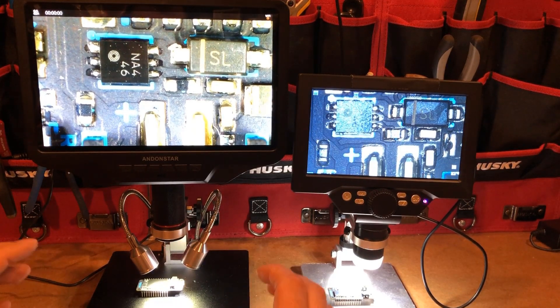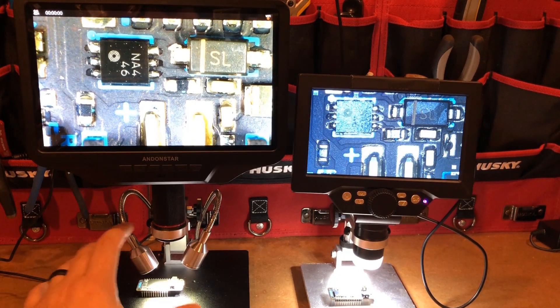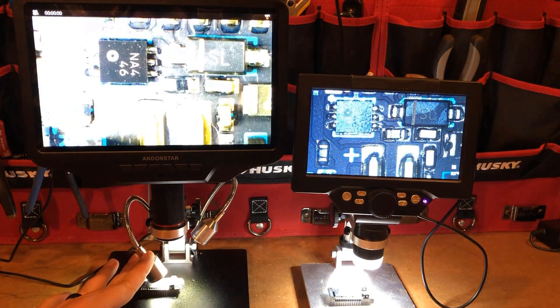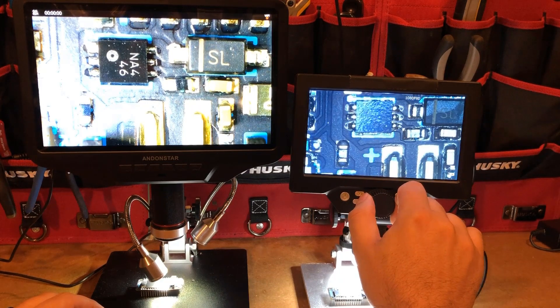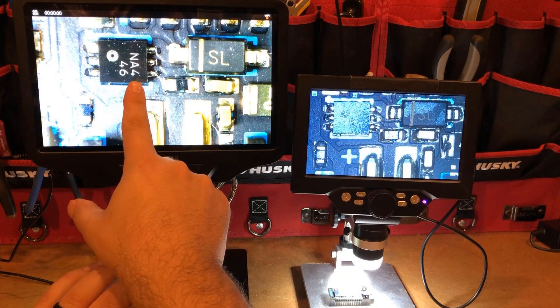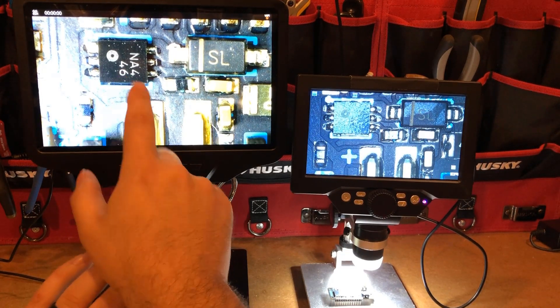That makes this microscope fantastic for anyone who wants to do live streaming or live teaching where you want people to see what you're doing in real time. A couple of other things really stand out about this microscope — the ability to position these lights exactly where you want them is kind of huge. You can put them back here and light from this way, or come right down and get a ton of light on something you can't see. And the optics are sharp enough that if I get it tuned in perfectly, you can read letters crystal clear. That's not just screen size — that's better lighting and better optics. When you're trying to read small part numbers, that is irreplaceable.